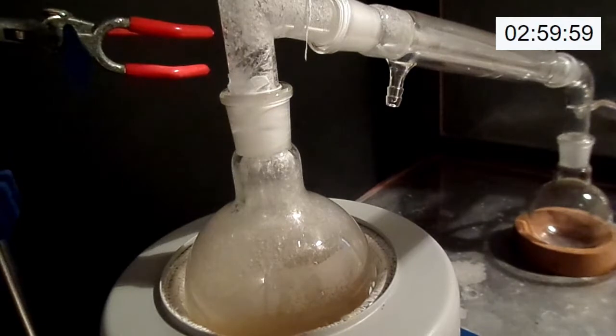We can observe some material on the upper portions of the flask and the distillation apparatus.